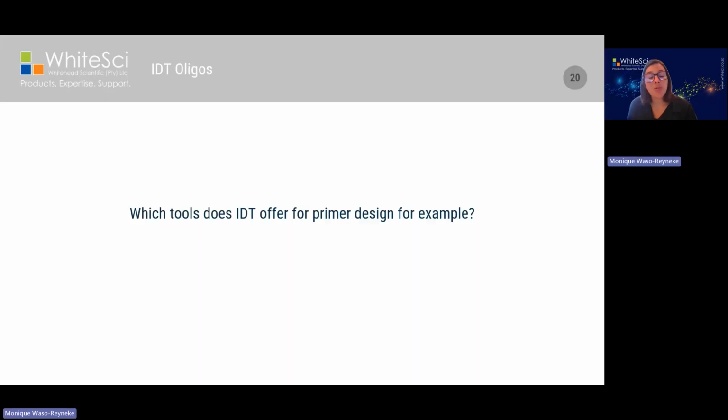One of the other questions we do get quite often is help in terms of primer design or assay design. And so I just want to show you this video to show you the IDT tools that are available. So if you have an IDT portal login details, you can log in and use any of these tools free of charge as many times as you want.